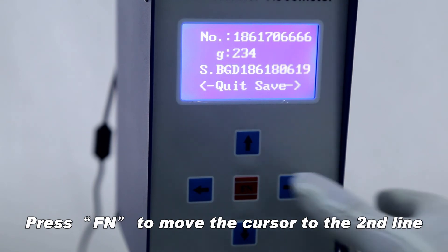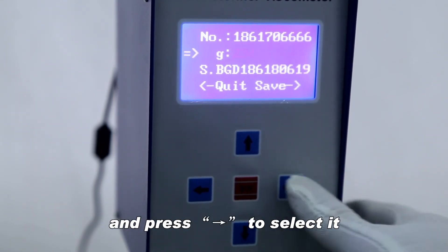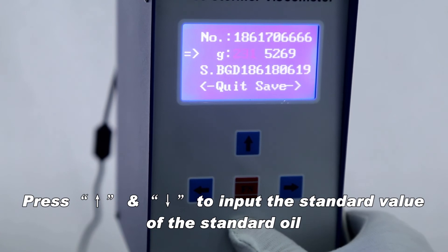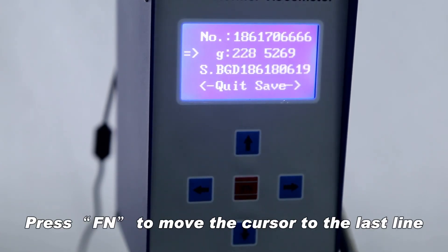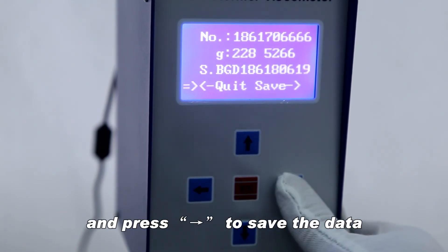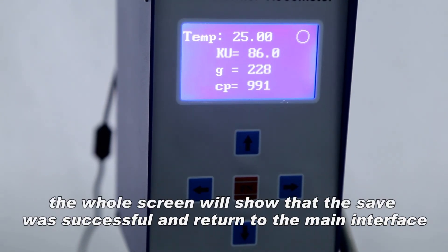Press FN to move the cursor to the second line. The number following the G will start to twinkle — press to input the standard value of the standard oil. Press FN to move the cursor to the last line and press to save the data.